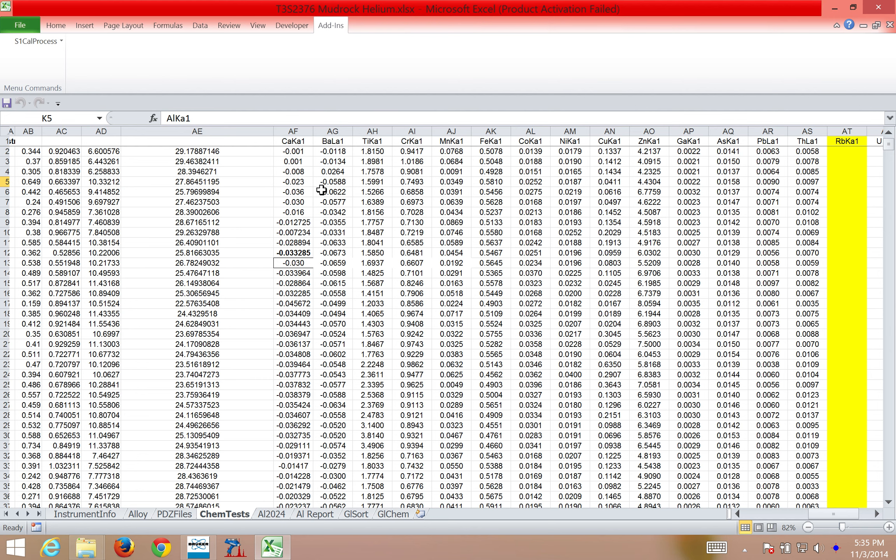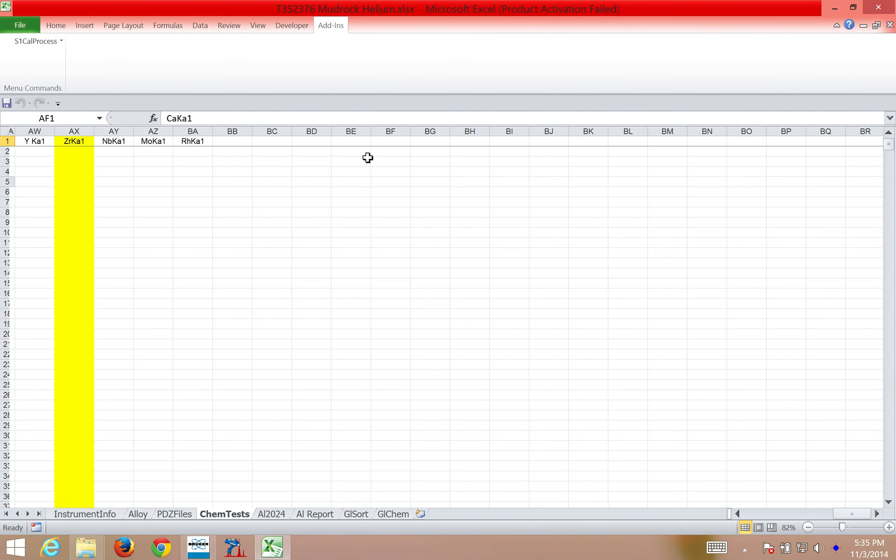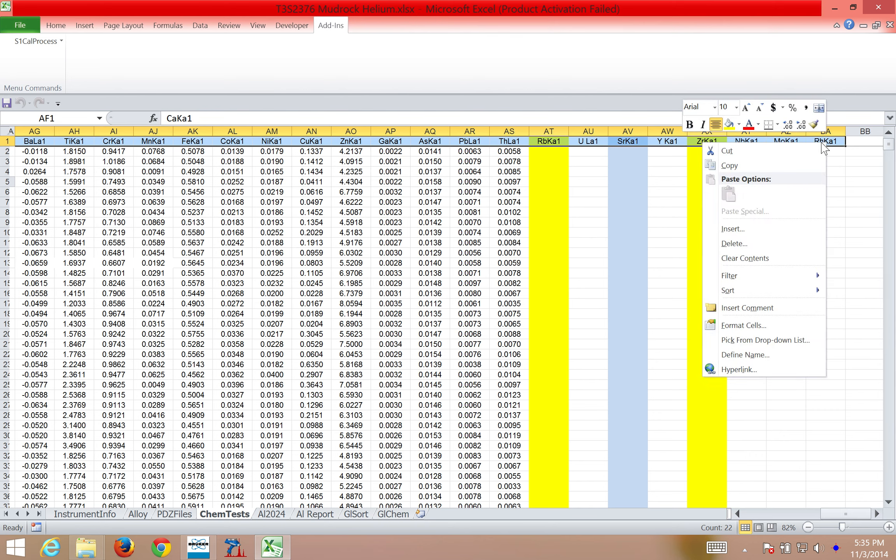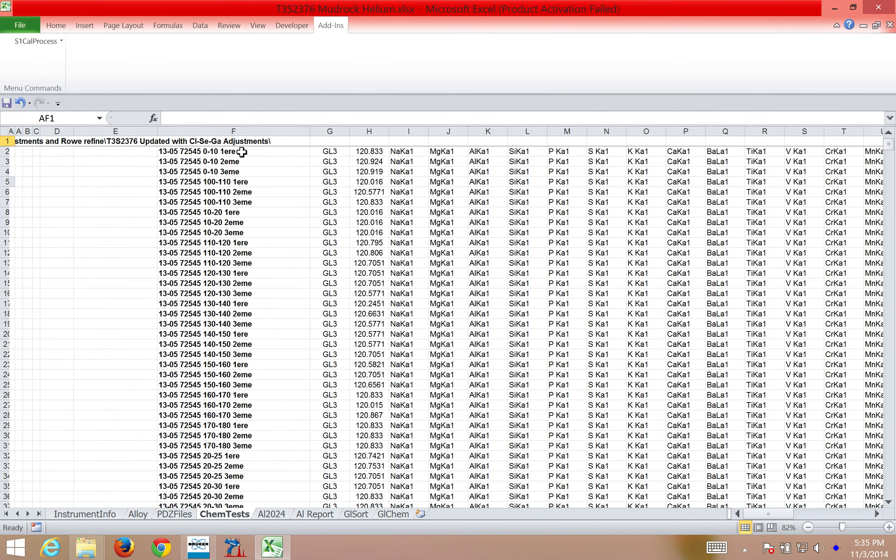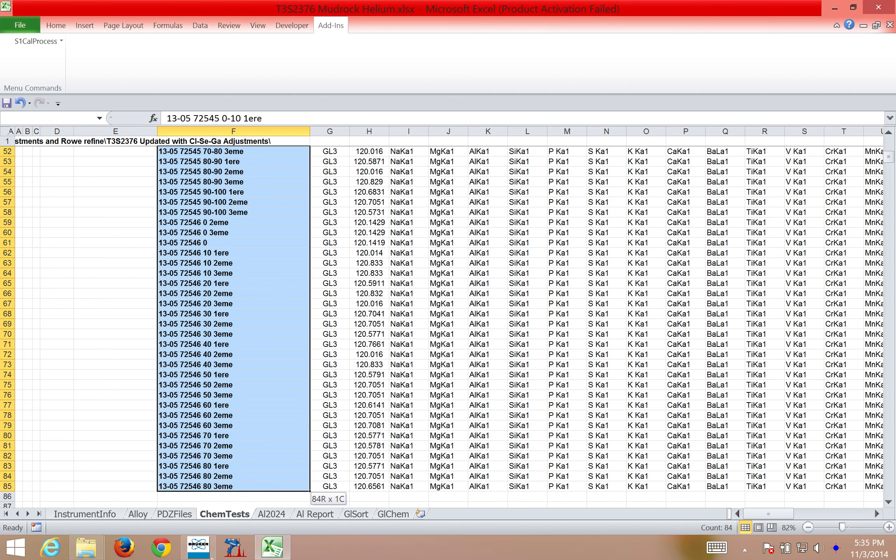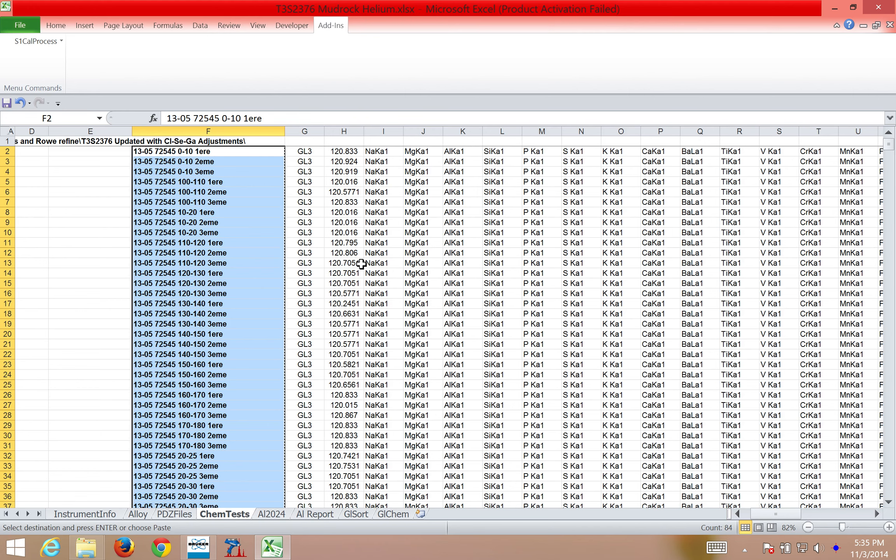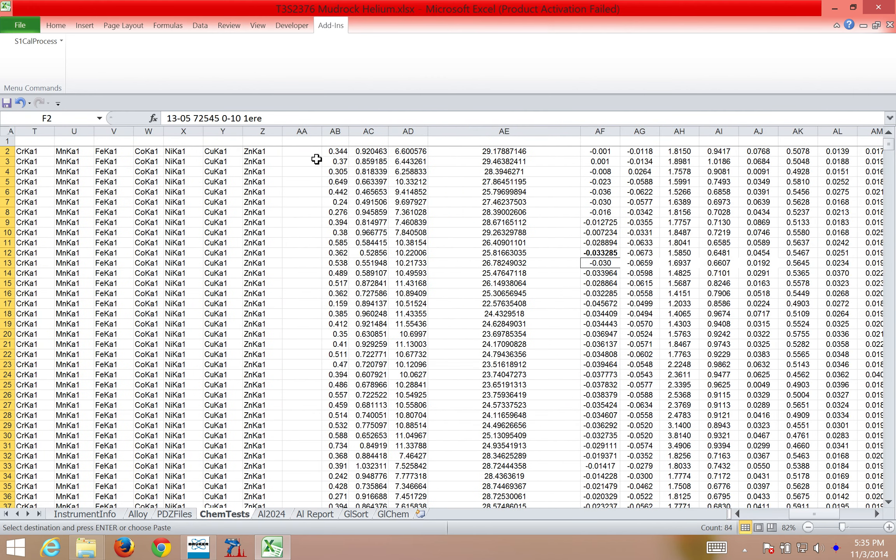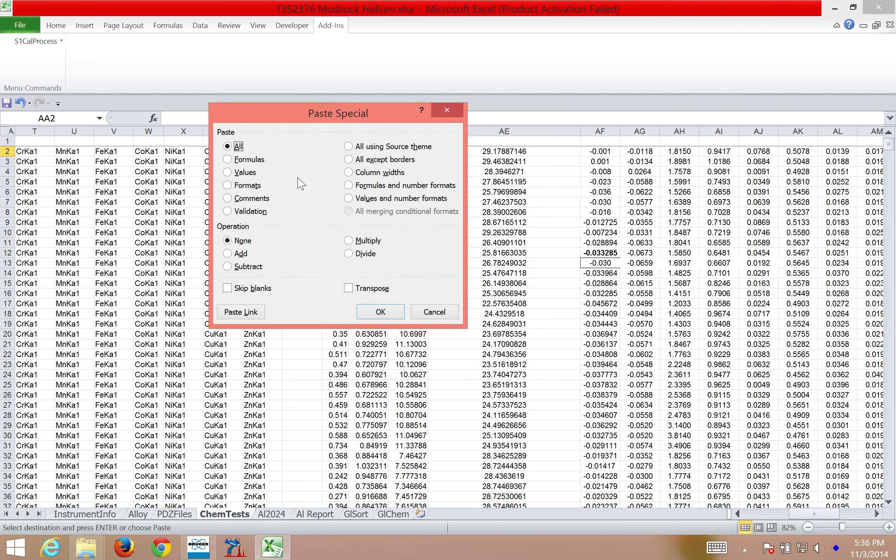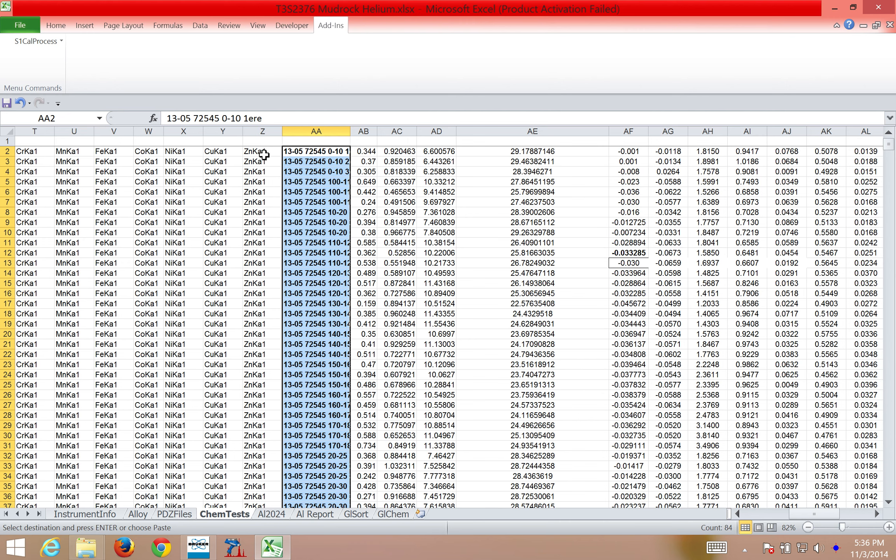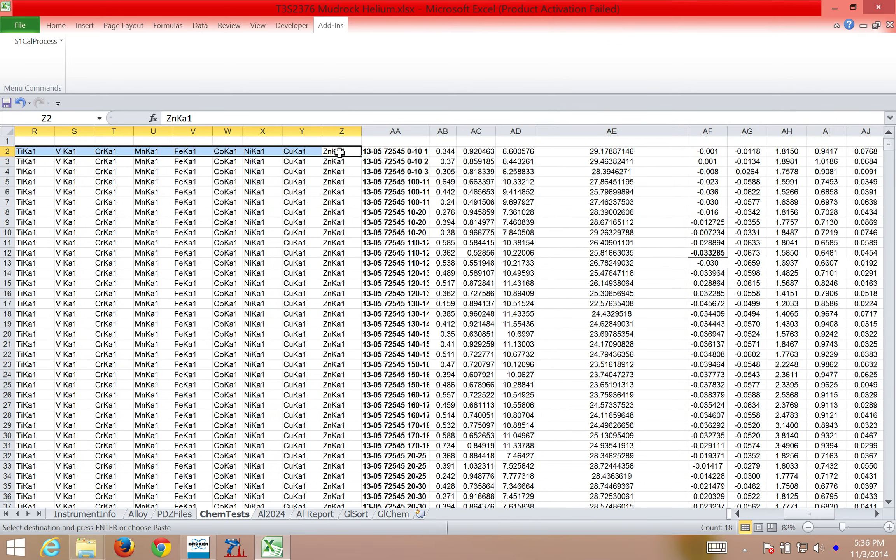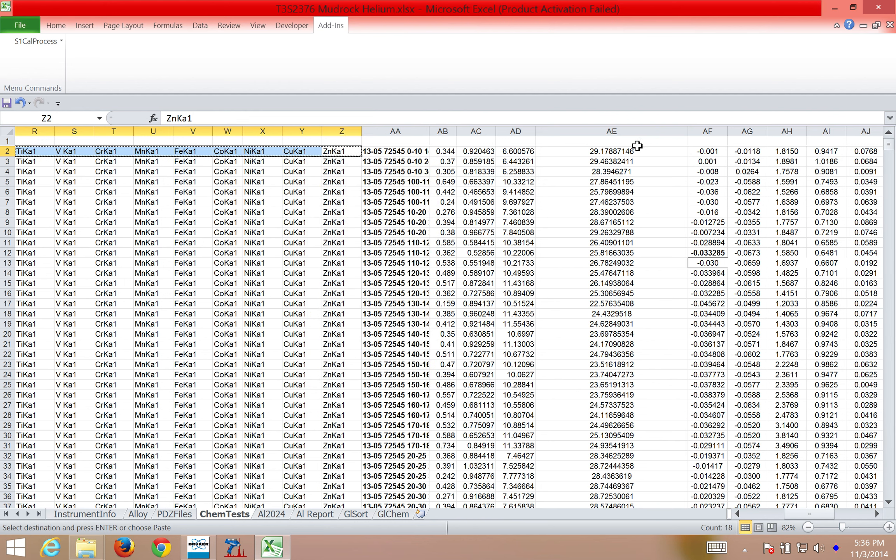Now you notice it doesn't make much sense right now, but that's because there's some cleaning up that needs to be done. So here, I'm going to clear those contents. Next, I come over here, and I select my file names, and I copy them. Come over here, and I paste. There's all my file names. You can see it a little more clearly there. Then I take the element headers here, from Sodium to Zinc. I'm going to copy, and then I'm going to paste here.